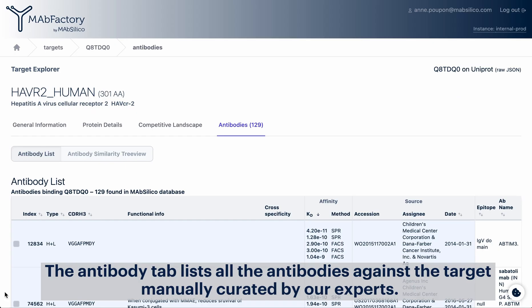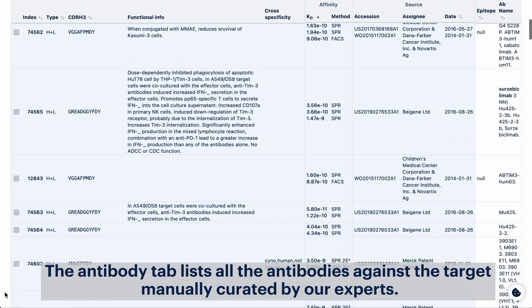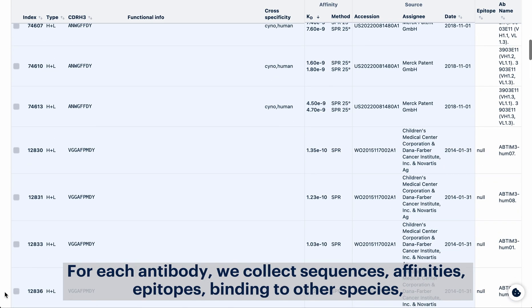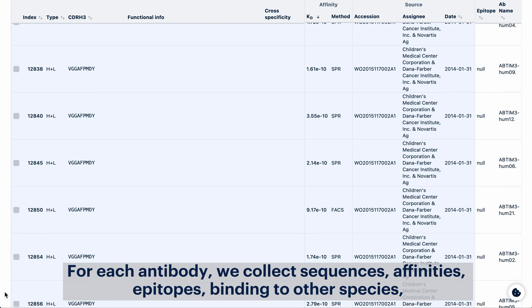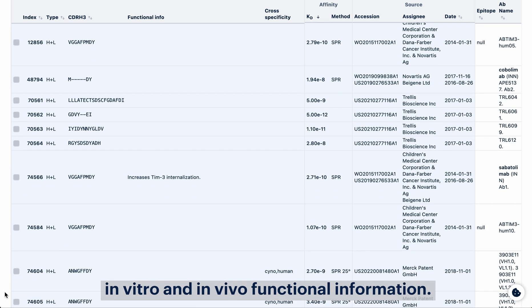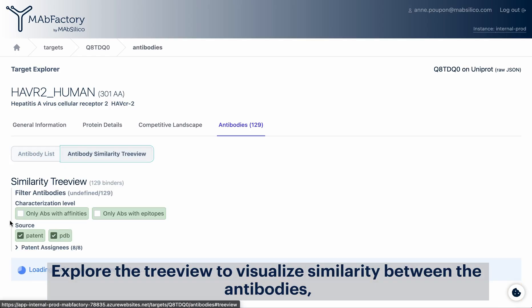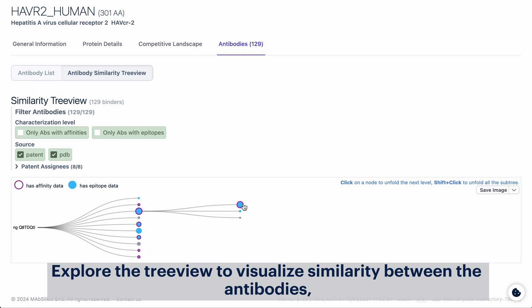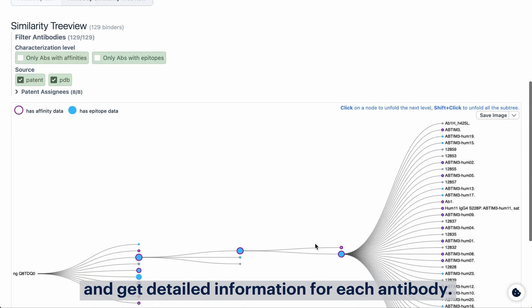The antibody tab lists all the antibodies against the target, manually curated by our experts. For each antibody we collect sequences, affinities, epitopes, binding to other species, and in vitro and in vivo functional information. Explore the tree view to visualize similarity between the antibodies and get detailed information for each antibody.